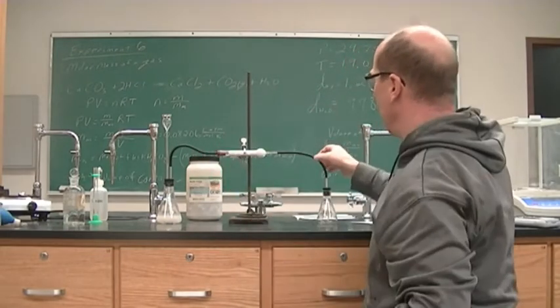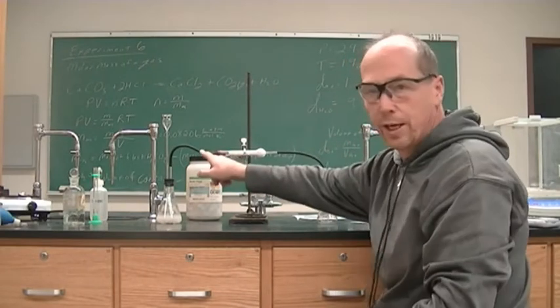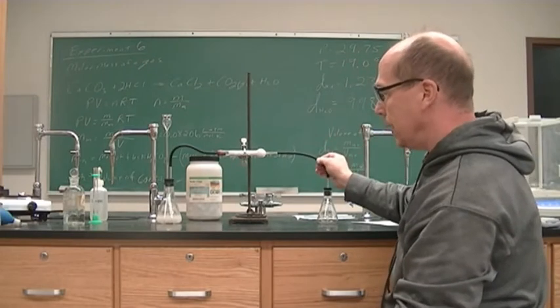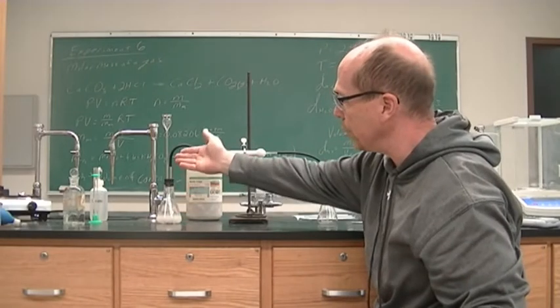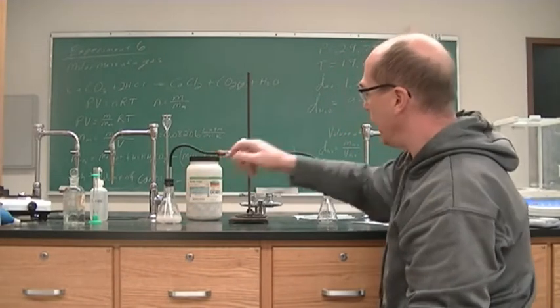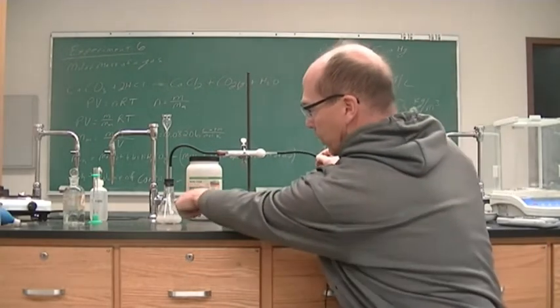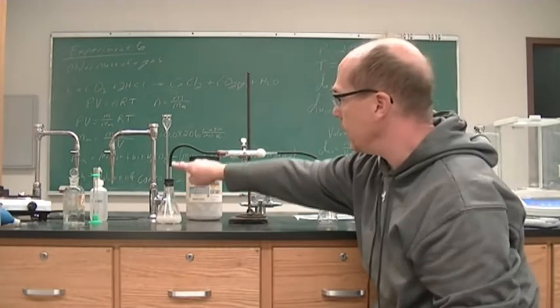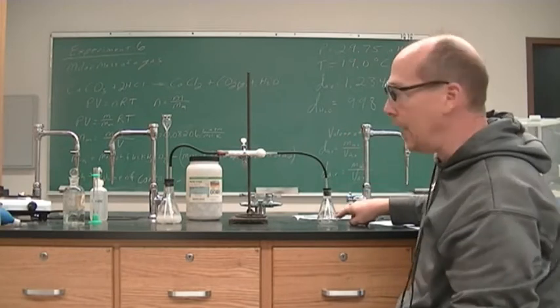All right, so that might have been loose there. Now the liquid's going up. So I had a loose connection here, and I would only know that by pinching this. Since the pressure didn't increase and push the liquid up this tube, I knew that there was a leak over here. And so now I have fixed the leak. When I push this, I see the liquid going up the tube. And so I know that the flow of CO2 is coming into this flask.